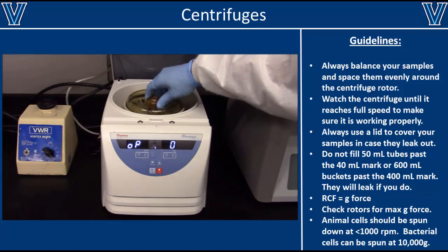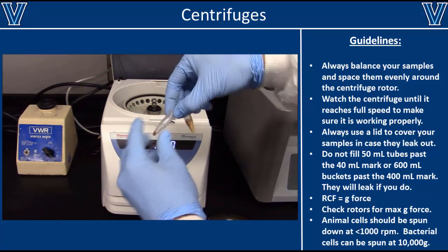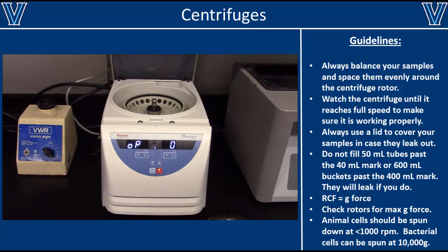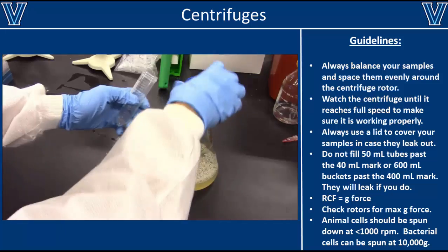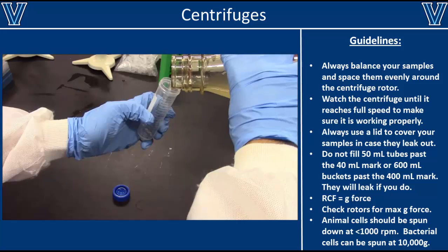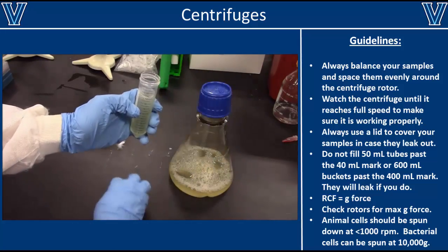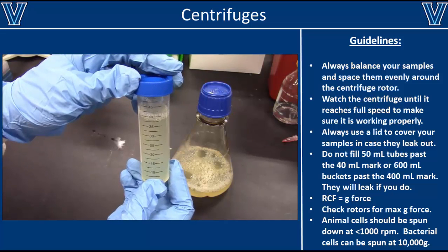Once the centrifuge has finished, wait for the rotor to completely stop spinning, then remove your samples. You should always check your samples to make sure the desired sedimentation has occurred. When you're done with the centrifuge, put the rotor lid back in place and close the main lid. Whenever you're using larger centrifuges that use buckets or 50 ml tubes, it is important that you only fill them up to about 80% of their maximum volume. For instance, here we're only filling up the 50 ml tube to 40 ml. This is because tubes and buckets do not have perfect seals. Therefore, when they're spun at high speeds, they can leak out if they're overfilled.